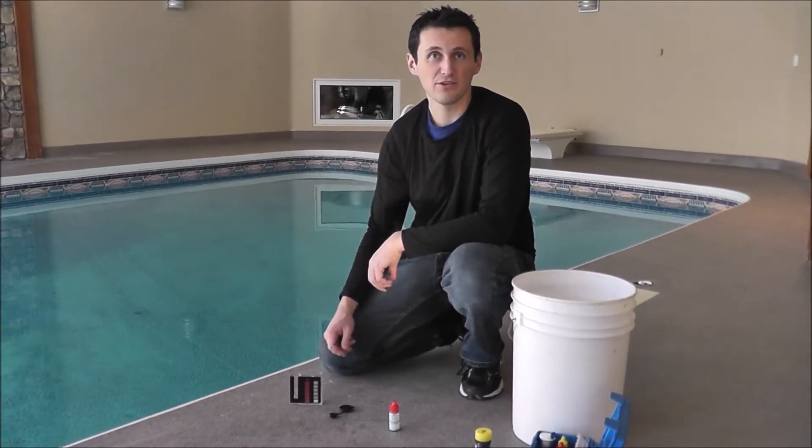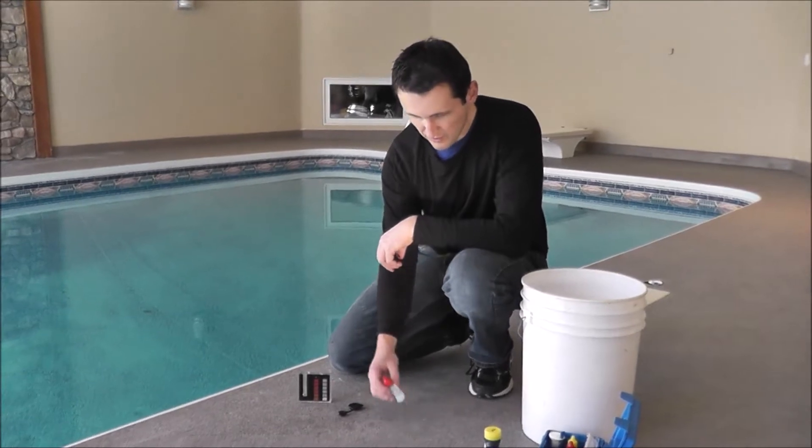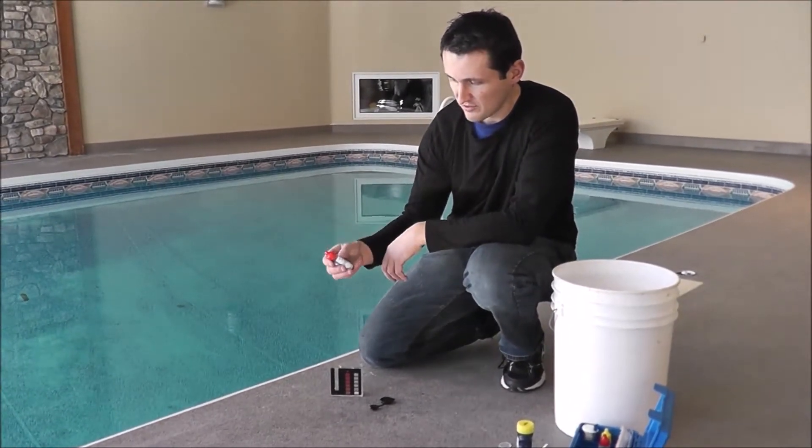Hi, this is Dale from UVPools. Today I'm going to show you how to test the pH in your pool water. So we have a tailored test kit here — it's a dropper type test kit. And this is a reagent called Phenol Red.